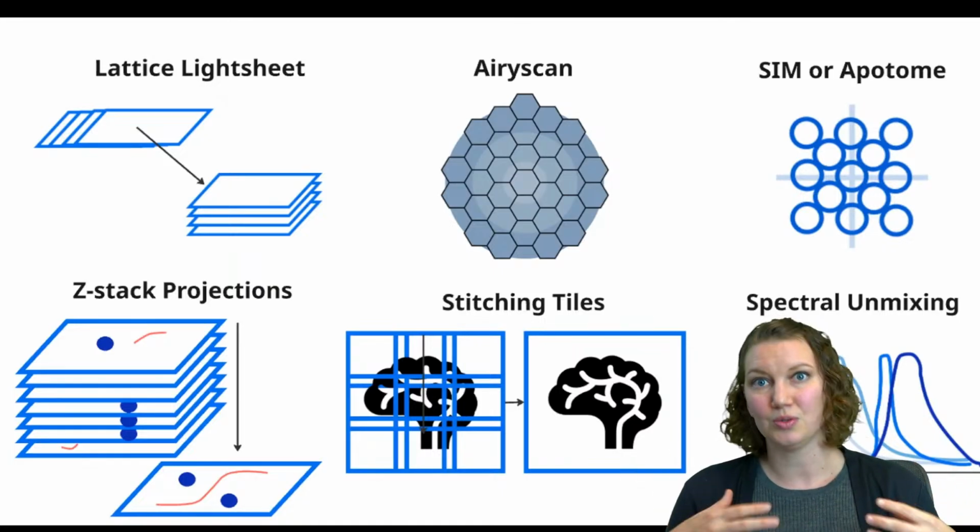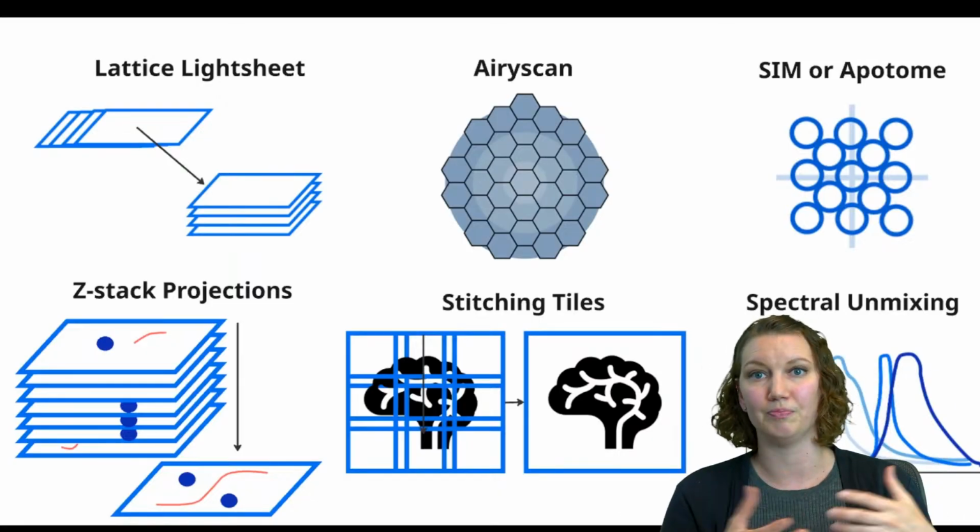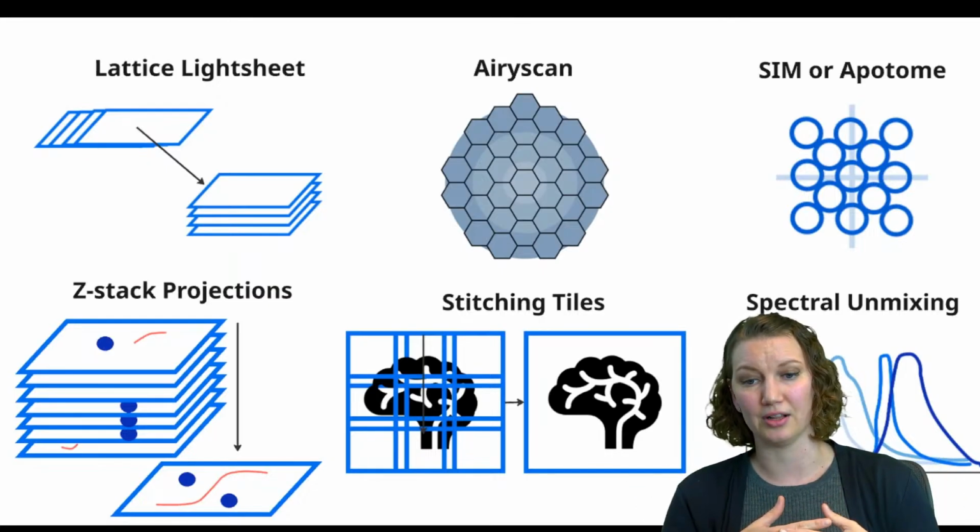And the reason why that's important is because we always have to process that raw data that comes from these 32 individual detectors before we can do any analysis with it or more easily visualize our final experiment.